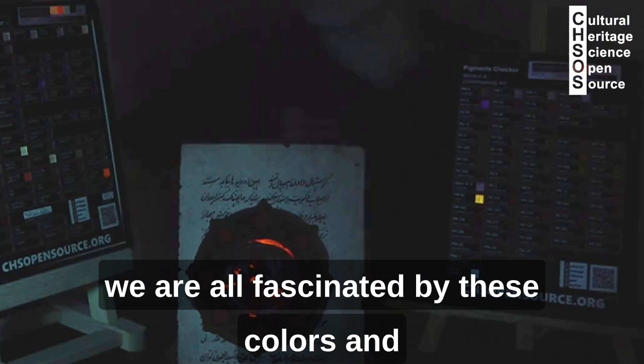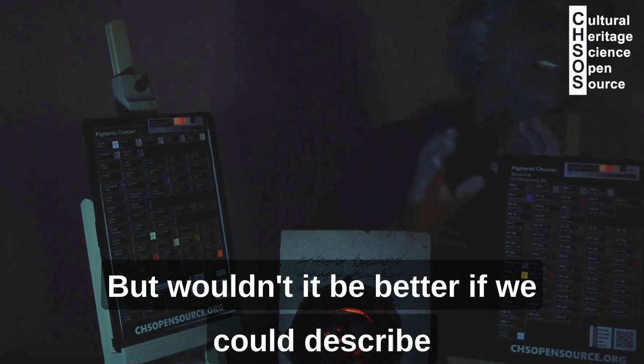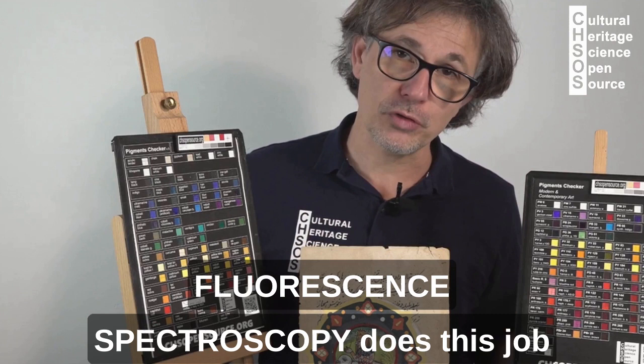We are all fascinated by these colors and we describe them as yellowish, orange color, pinkish color — but wouldn't it be better if we could describe them with a measure?